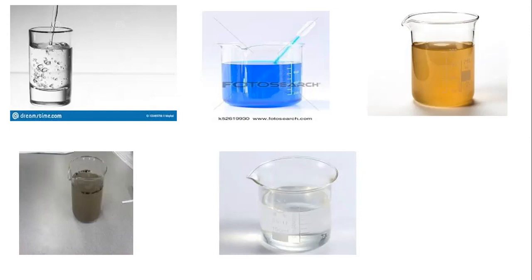So that's why, from the second, third, and fourth pictures, we can easily say that chemicals are present, but in the fifth picture, with the naked eye, we can't predict it. So to predict the extent of chemicals present in the wastewater, we can conduct an experiment called chemical oxygen demand.